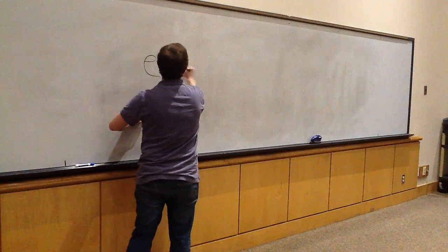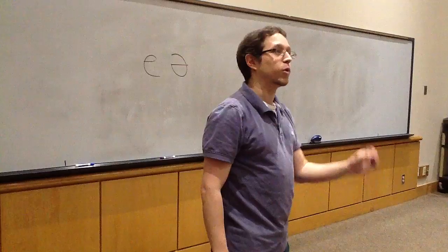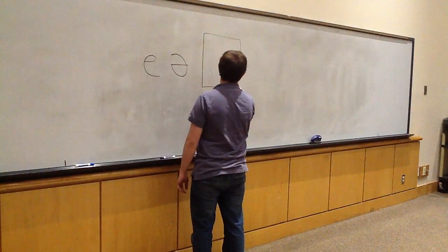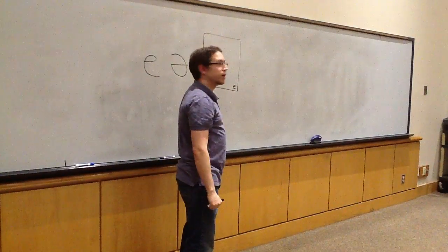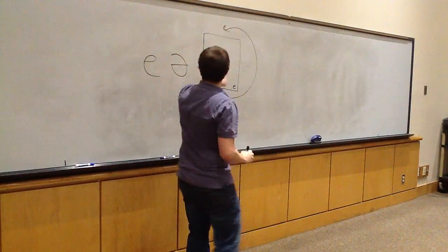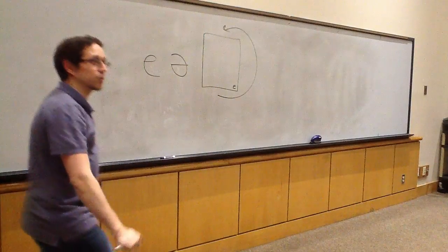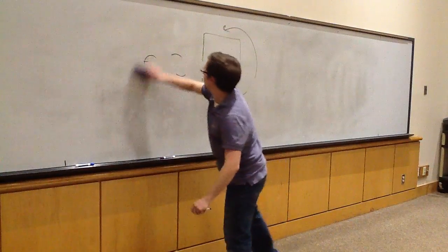It was inverted. Okay? Real quick, there's a super fast trick you can always remember and always do, and it will always show you what a letter looks like under the microscope. All you do is take a piece of paper and write the letter the way that you normally see it, and then you turn the piece of paper completely upside down. Whatever you see, that's how the letter looks under the microscope. So if I turn this paper like that, that E is going to look like that. Super easy. My students, if you can't remember, I should see you turning your papers if they ask you that question. Okay. All right, now, let's talk about the 3 different cell types.